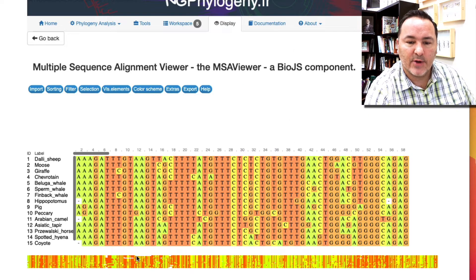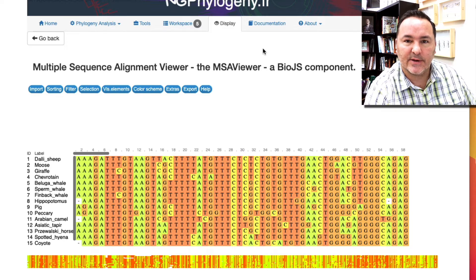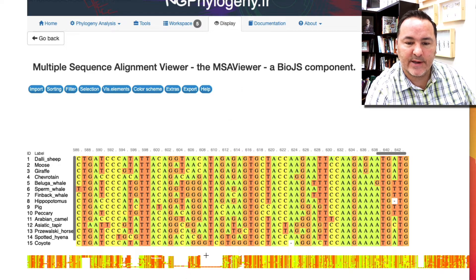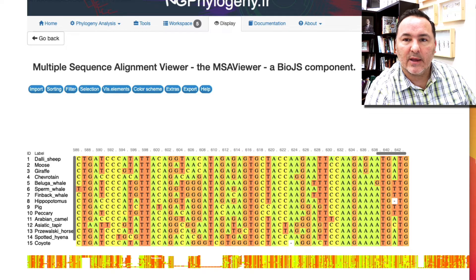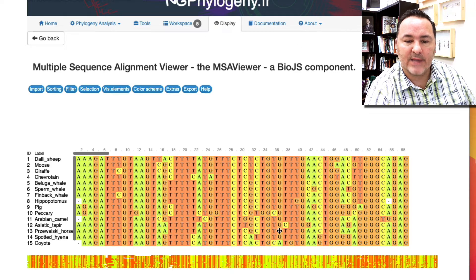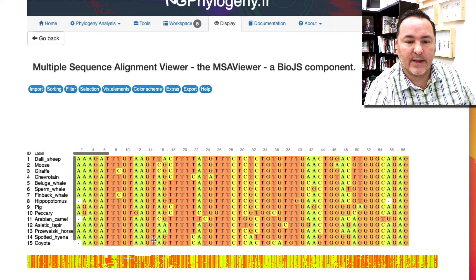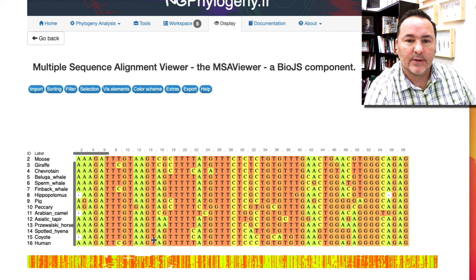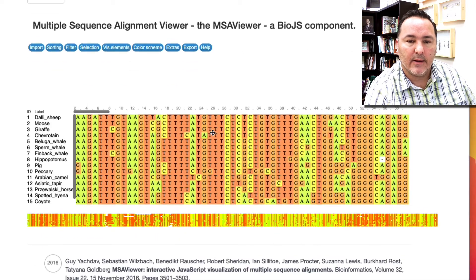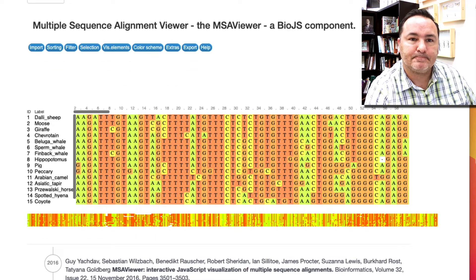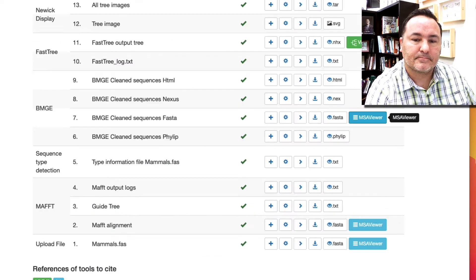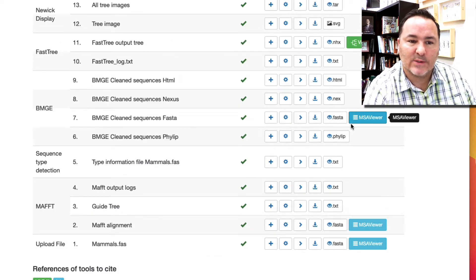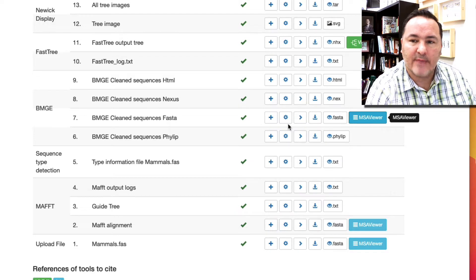So now notice the difference here. I'm going to go back and forth. Remember there were these areas of big gappy areas, and those are now all gone. They've been excluded.